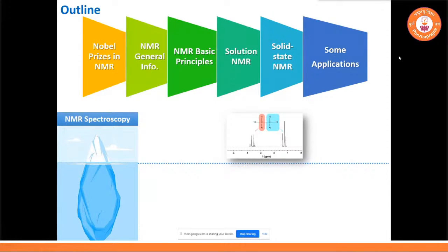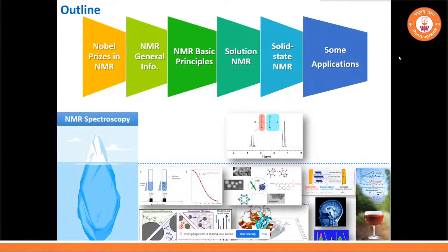So this is a general trend, a general perspective of what NMR is. Usually we say NMR gives structural characterization and molecular fingerprint information for a molecule. Actually, this is just the tip of the iceberg. There is a lot NMR can do, such as molecular diffusion in a variety of systems, and polymer chain dynamics. And it is the biologist's favorite tool, because you can use NMR to get structure and dynamics information of proteins. That's why biologists love NMR.